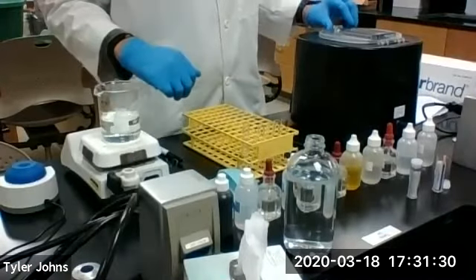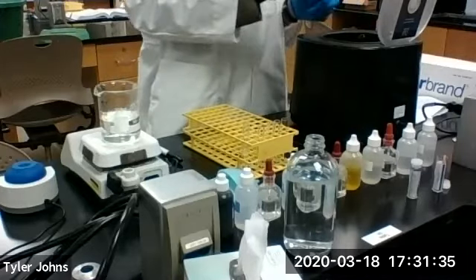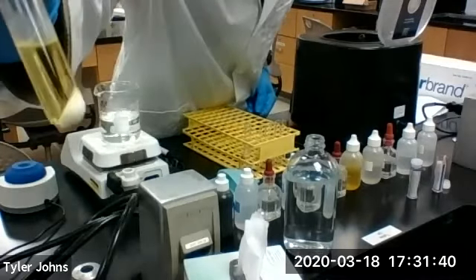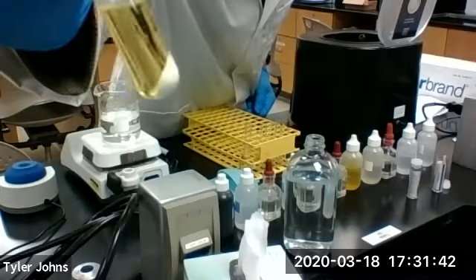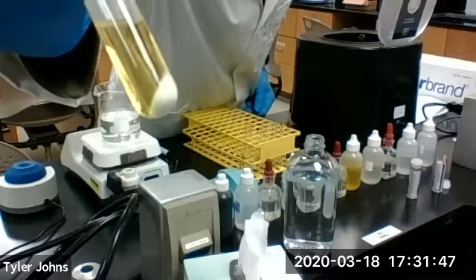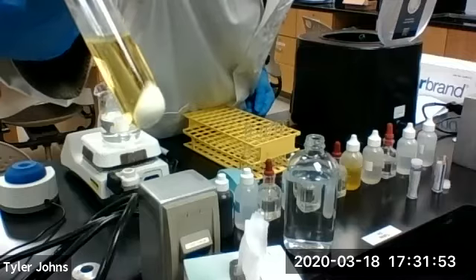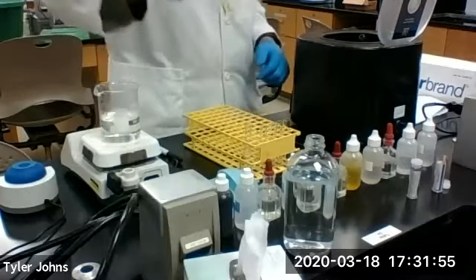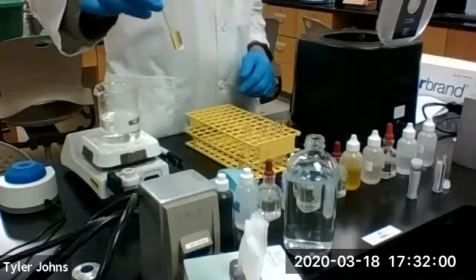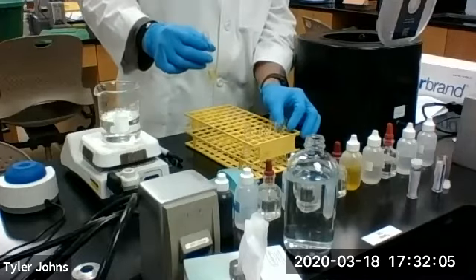Okay, at this point, the centrifuge is stopped. We'll remove our test tube. As you can see, inside the yellow solution, we have a white precipitate. That white precipitate is calcium oxalate, and it confirms the presence of the calcium ion. Now, for further confirmation of the presence of the calcium ion, we're going to decant the yellow solution.